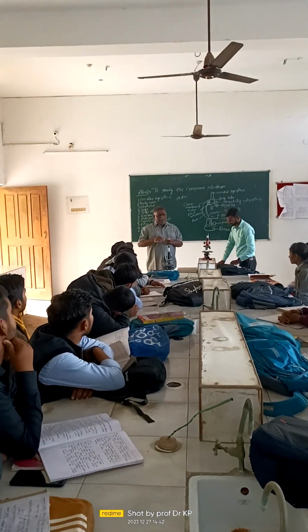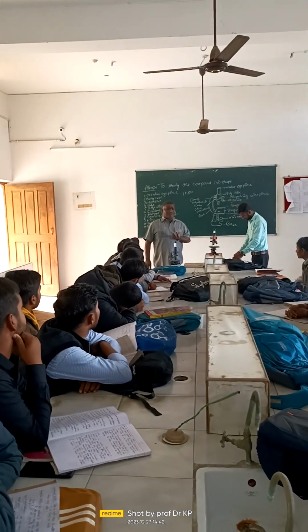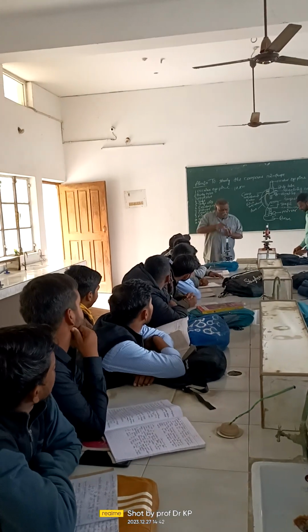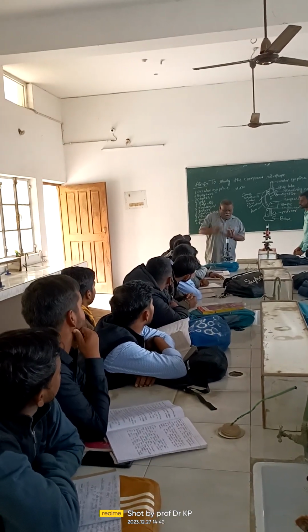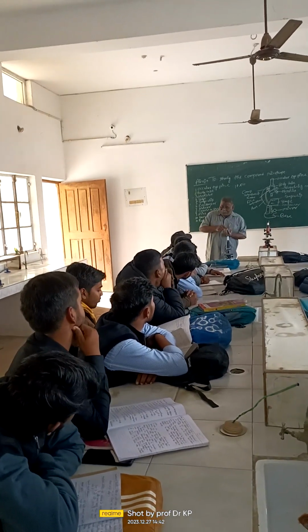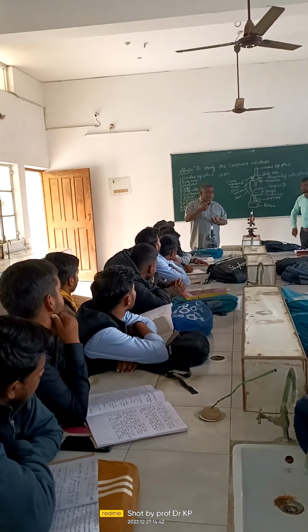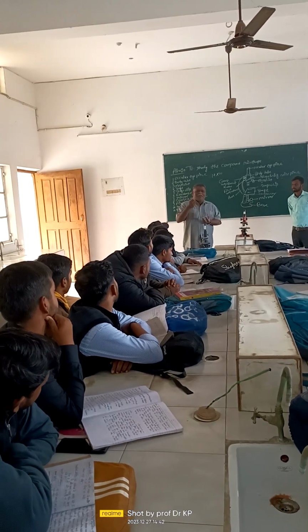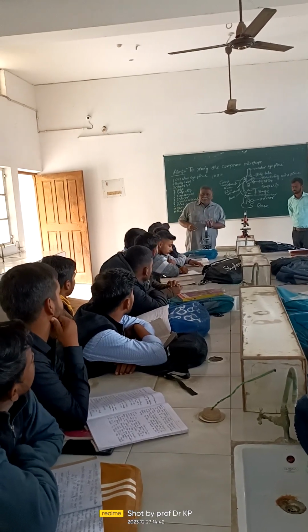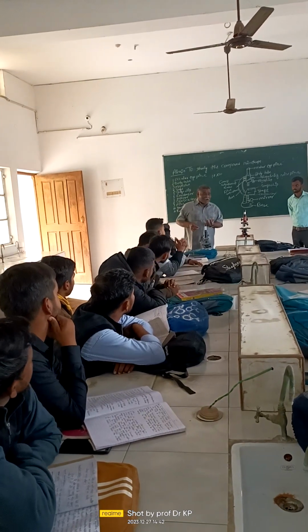In pharmacognosy, when you use the slide, you must also have some other materials necessary. One is a needle, called a dissecting needle, in order to remove, take or place a structure somewhere, or to isolate structures under the microscope. Next one is the camel hairbrush. Ten rupees or twenty rupees, it should be there. That will be very useful to mix the solution along with the structure and place it over there. Okay? Not with the hand or any other thing.